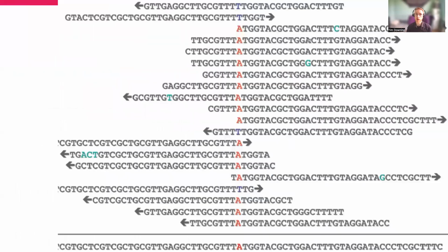And that can inform mutation detection. So we see something like this where we have our reference up the top, and then we have this pattern here where we might have a T in the reference, whereas our reads might suggest that actually that allele is an A for this particular sample. You can see certain instances where actually it's the same. It's somewhat different, like a T here and a T down here. So you also have to look at that information to understand more effectively what precisely is best in that situation.